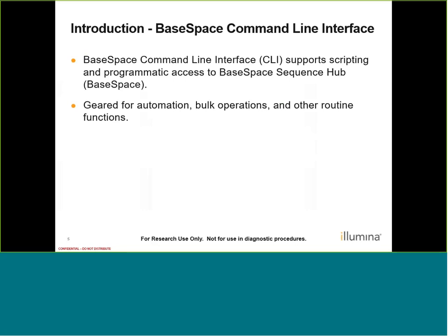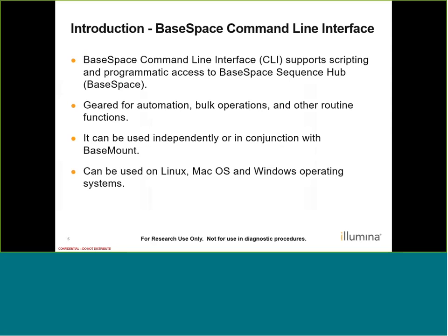When we say automation and bulk operations, we mean downloading runs and uploading FASTQ files. CLI can be used independently or in conjunction with BaseMount. Using the two together minimizes the need to toggle between your command line shell and the browser. CLI can be used on Linux, macOS, and Windows operating systems. Keep in mind that shell commands will be specific to the OS command line, meaning Windows commands will be different from Linux or Mac Terminal commands, but the CLI commands themselves will be the same. We'll see examples of this in our demos.